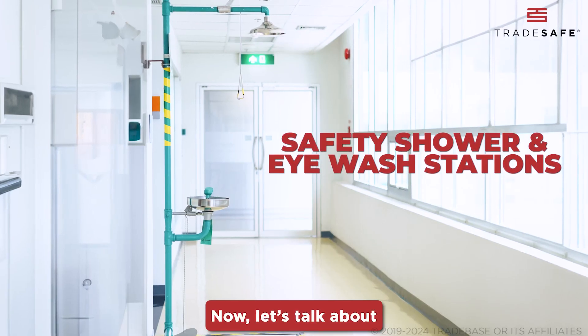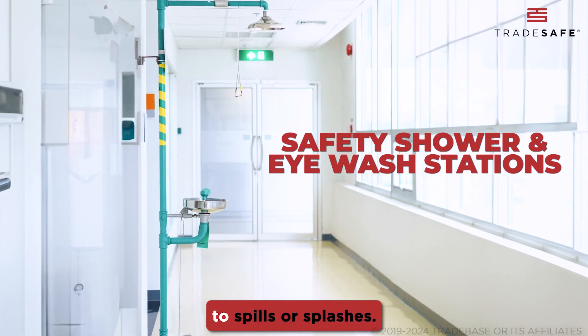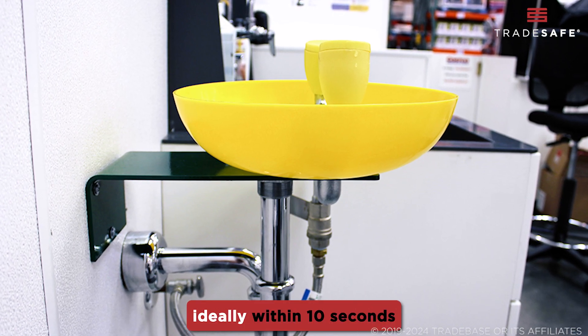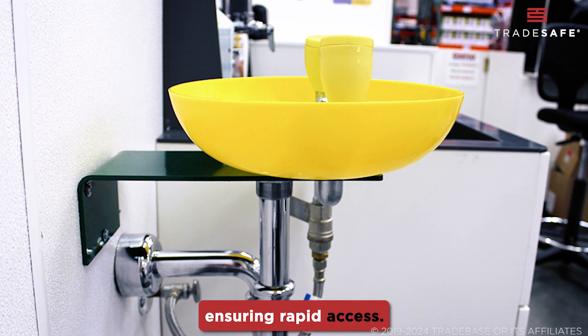Let's talk about safety shower and eyewash stations — essential for immediate response to spills or splashes. These stations should be no more than a few seconds away, ideally within 10 seconds of any hazard area, ensuring rapid access.